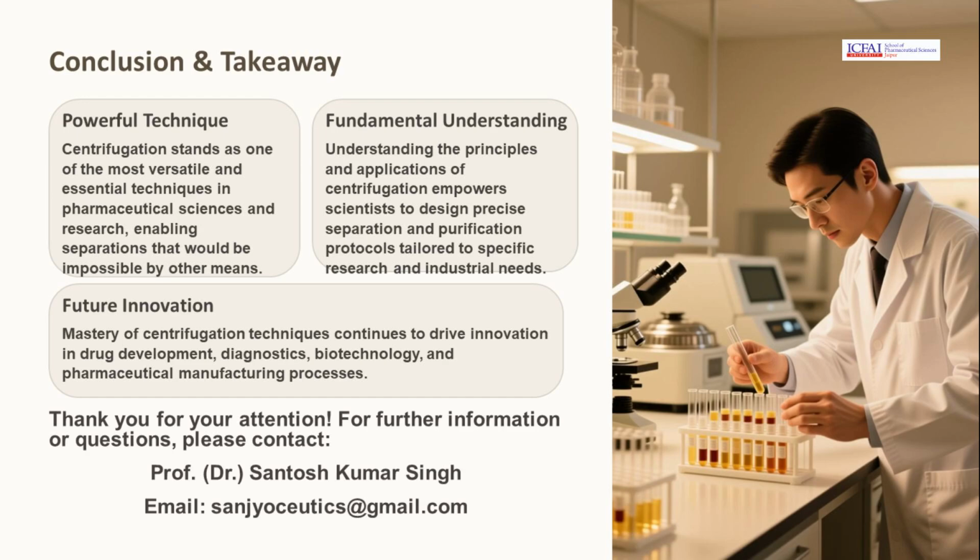In conclusion, centrifugation is a powerful technique in pharmaceutical sciences, offering fundamental understanding and potential for future innovation. It enables separations that would be impossible by other means and continues to drive advancements in drug development and diagnostics.